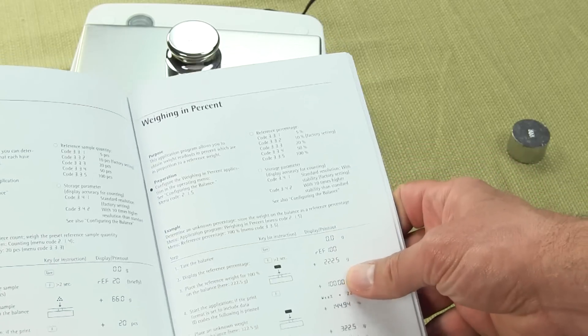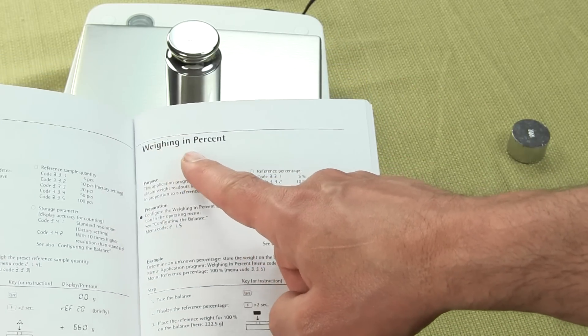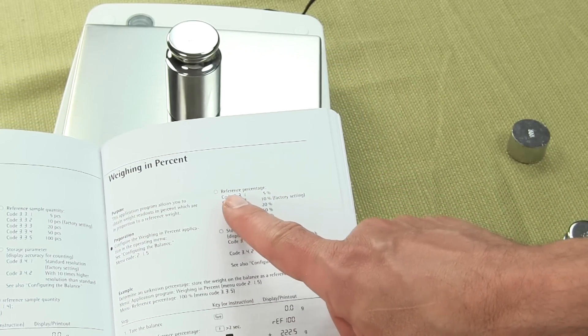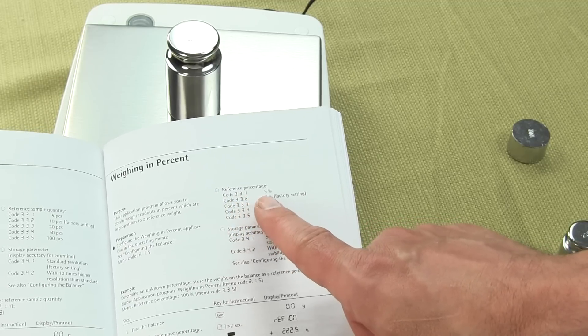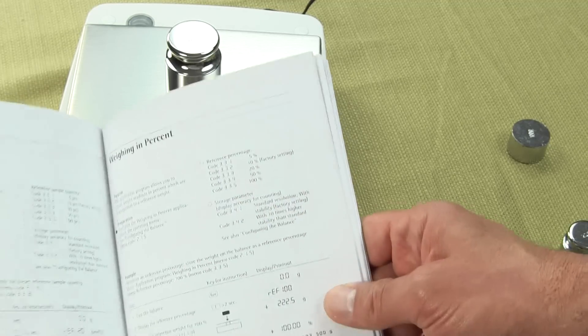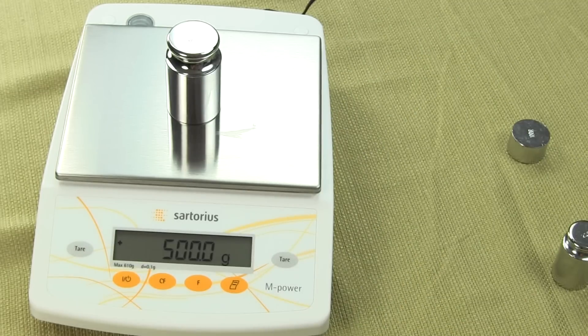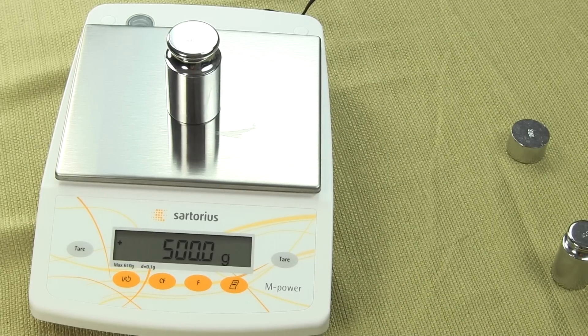Sartorius did a great job with the manual. You'll see here, this is percent weighing in percent mode, and you can configure it for 5%, 10%, 20%, 50%, or 100%. The manual is very well documented — easy to configure, and you don't need to hire any specialists. As long as you can read through the manual, you'll have no problem.